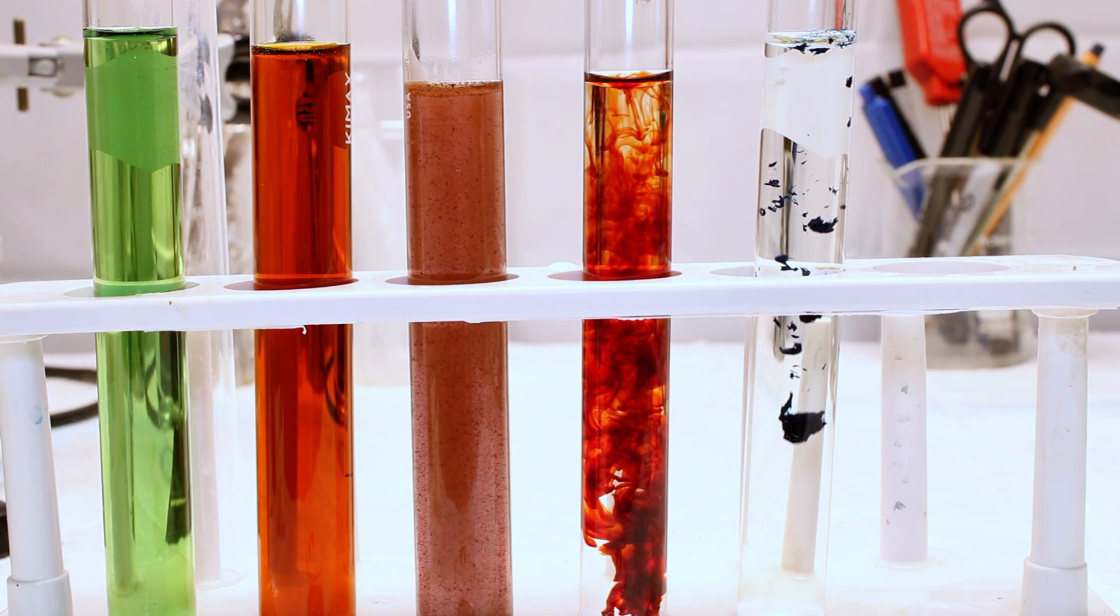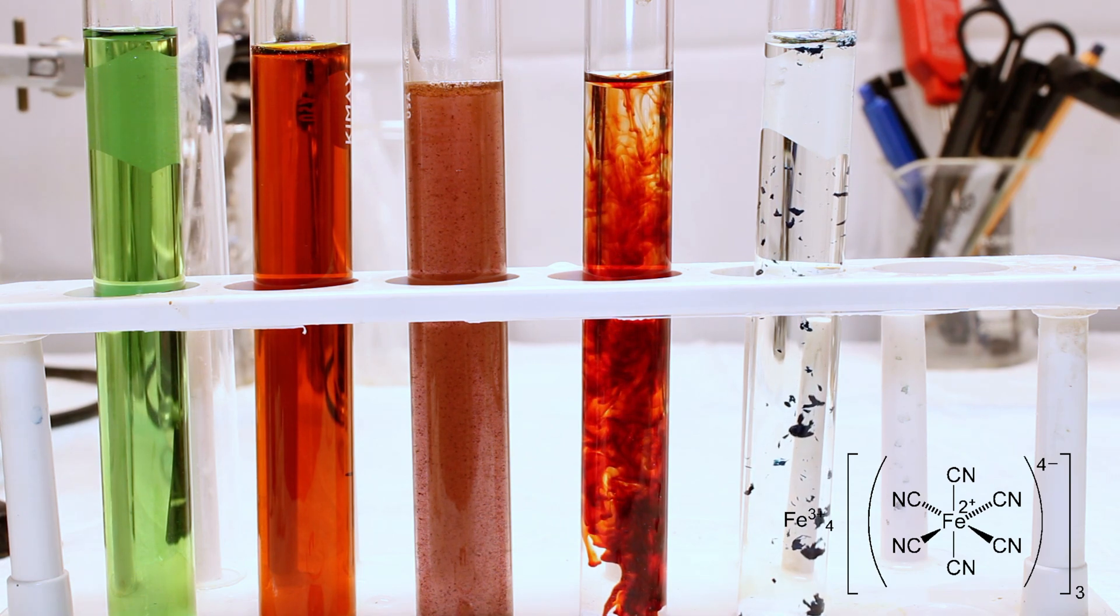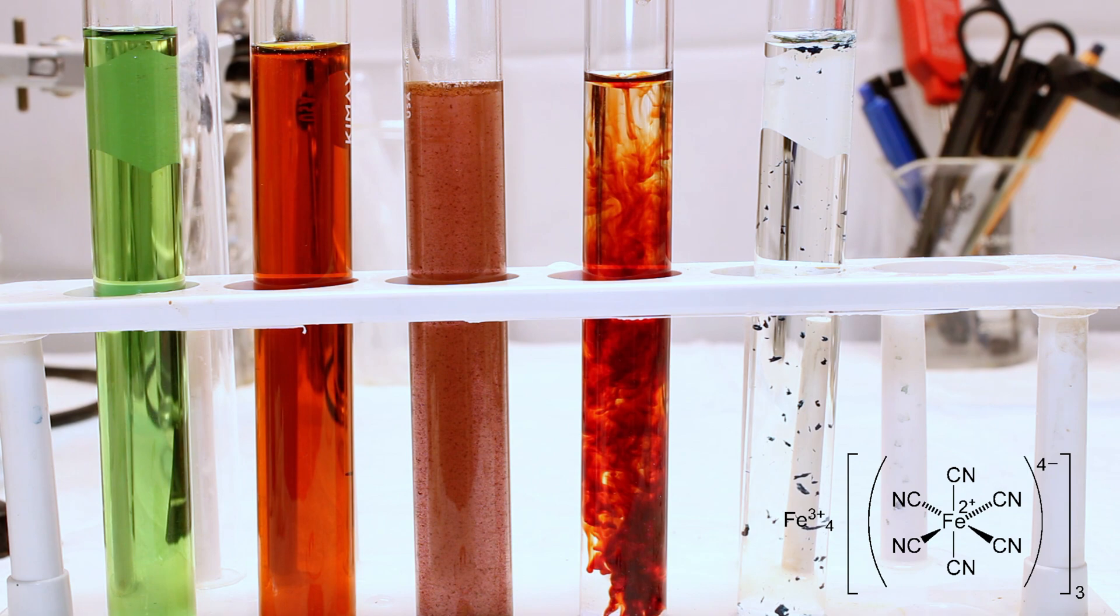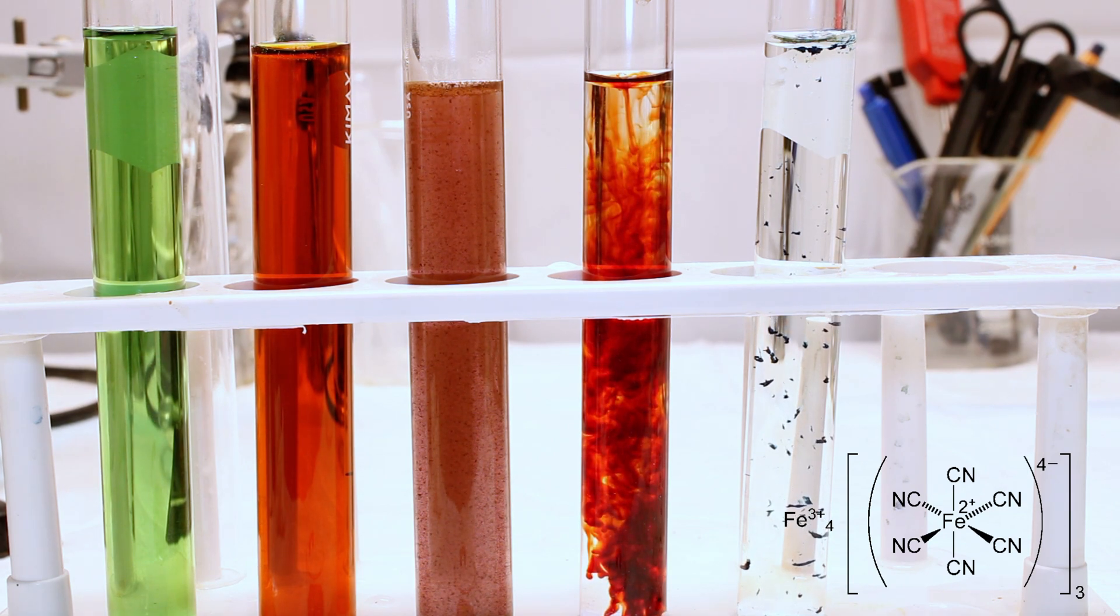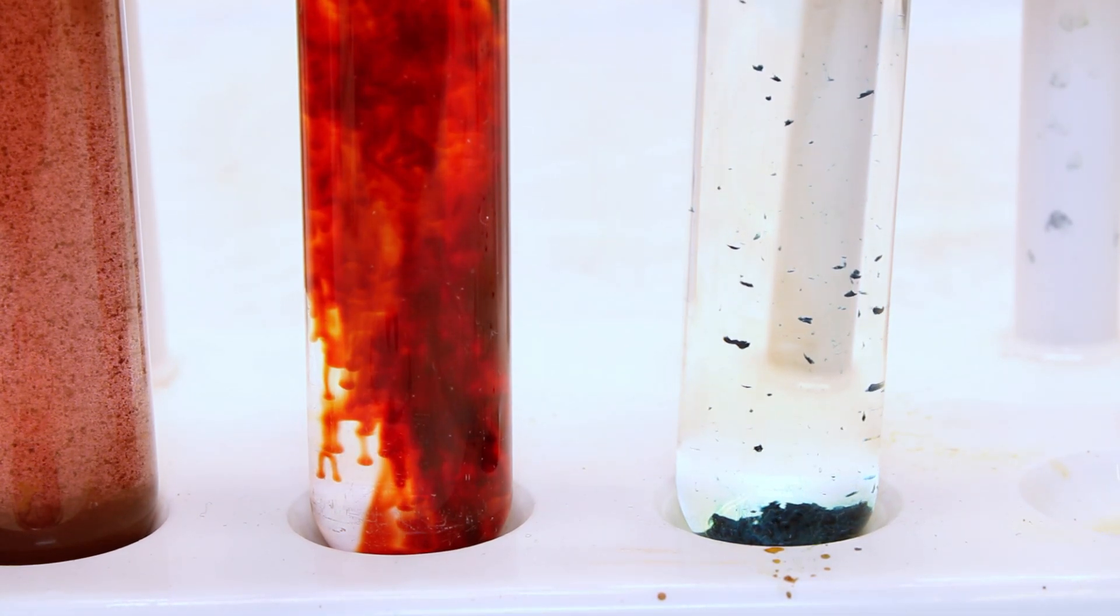You can also add some iron(III) chloride, or again any iron(III) salt, to a solution of potassium ferrocyanide. This forms a bright blue complex that's used as a pigment called Prussian blue. I've actually made this pigment before on this channel and I've got a video coming up where I'm going to make it again, so keep a lookout for that if you're interested.